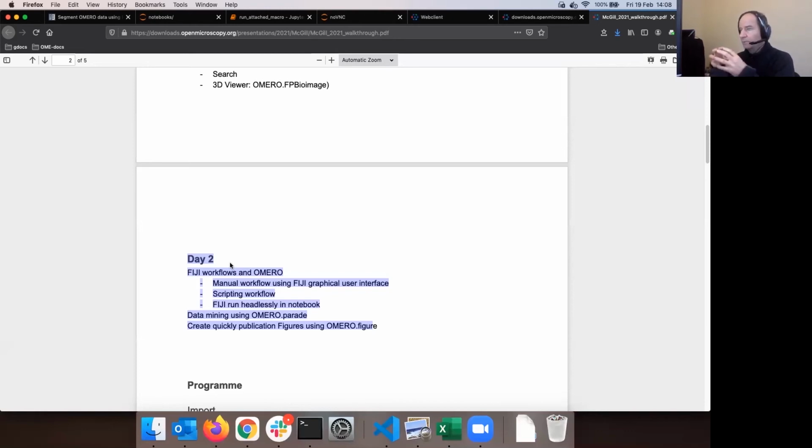And Omero, as we said, is not concentrating on delivering image analysis solutions out of the box. Instead, it allows these third-party tools, these packages, these programs, such as Fiji, for example, to connect to the images inside the Omero server using this intermediate plug called Omero API.